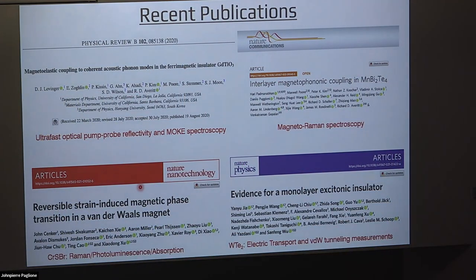What's some of the science people have been doing with this? Just a spattering of relatively recent papers here. They're doing a lot of MOKE, Raman, and electric transport. Photoluminescence, absorption, all sorts of different things on a wide variety of materials.